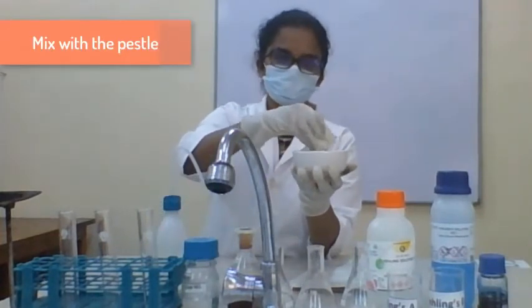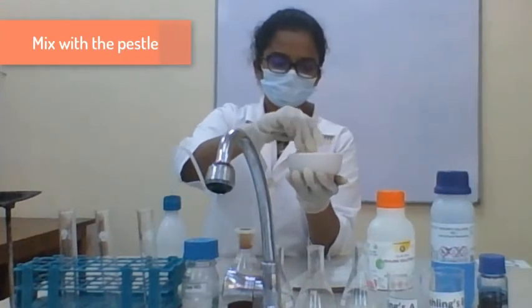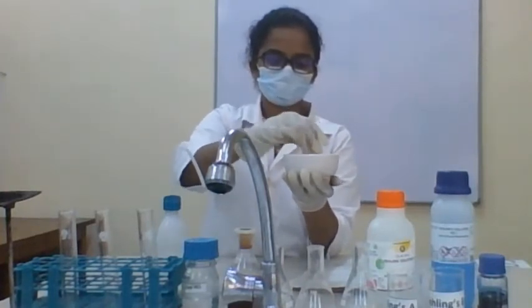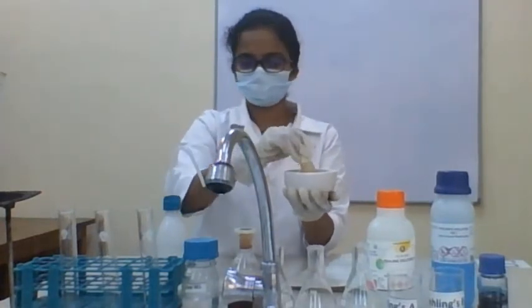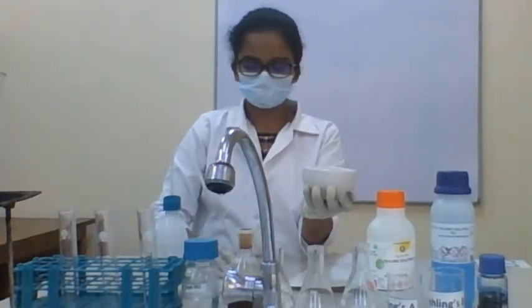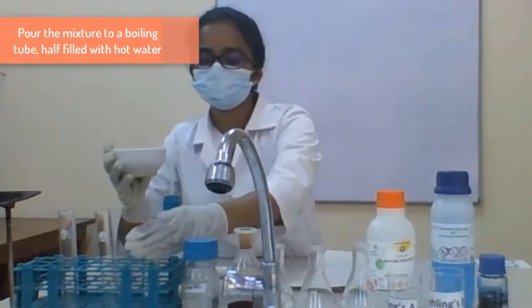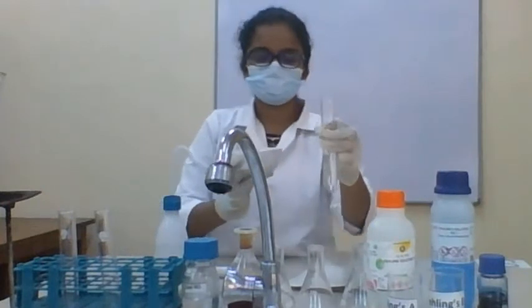I'm going to dissolve it properly. And then I'm going to add this mixture into a boiling tube half filled with hot water.